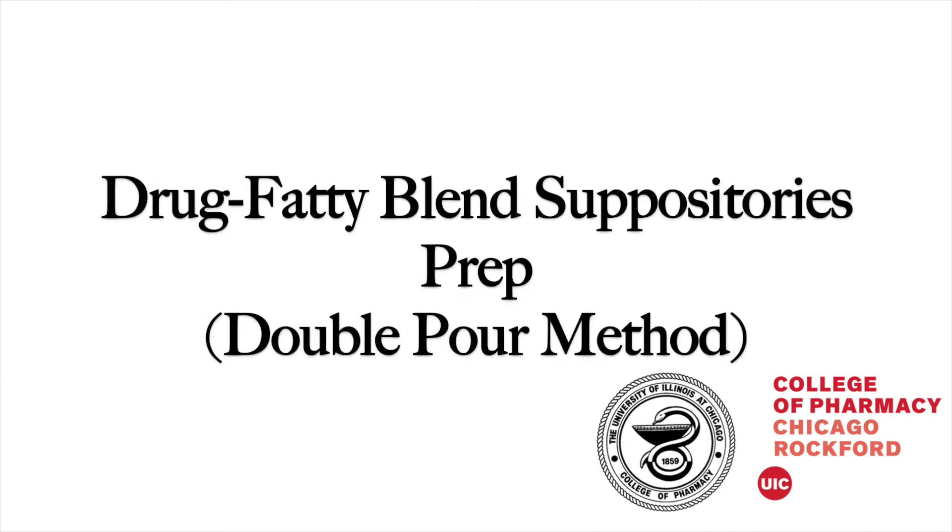For today's video in the pharmaceutics video series, we will be showing you how to make drug fatty blend suppositories.